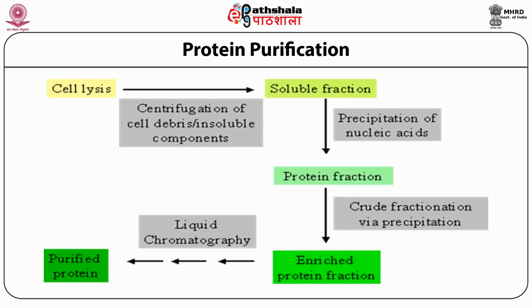There are several ways of lysing the cells. If it is just E. coli, one could simply do freeze-thaw methods or lysozyme, and then do sonication to reduce the viscosity. Once you pellet it out, take the soluble fraction. It's better if the protein is in the soluble fraction, and you remove the nucleic acids.